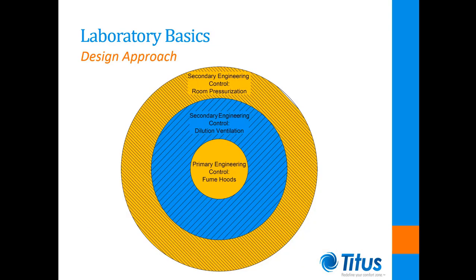In order to control contaminants, a similar setup to sterile compounding pharmacies and clean rooms is used with a primary and secondary engineering control system. Within lab spaces, this is achieved by utilizing fume hoods as a primary engineering control mechanism. These devices are engineered to capture and retain any chemical or biological contaminants as a result of the experimentation or testing being conducted. The entire room then becomes the secondary engineering control, where we are preventing any contaminants and/or odors from escaping the lab.